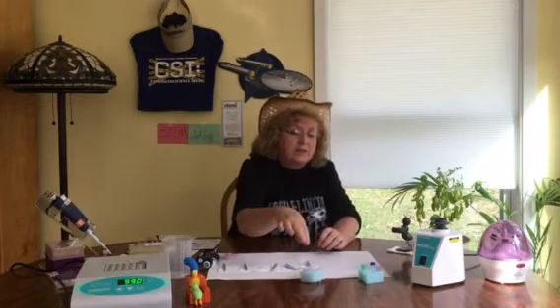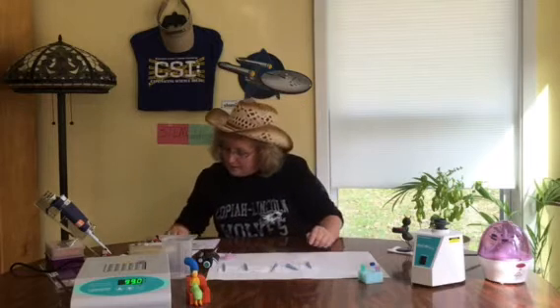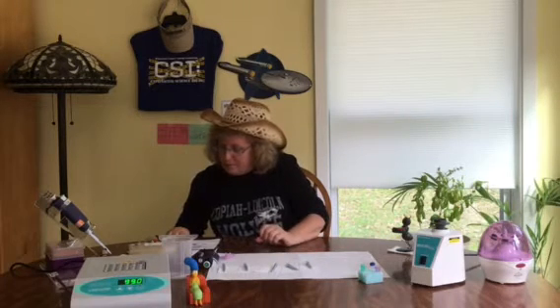You would do this for every insect that you have. You macerate, add the Instagene, vortex, and put it over here. So I would be doing the other 4. Now remember, I pretend like I've done the other 4. They're over here. After you've completed this, on number 9, place samples in the dry bath for 10 minutes, discard macerators and toothpicks while you're waiting.